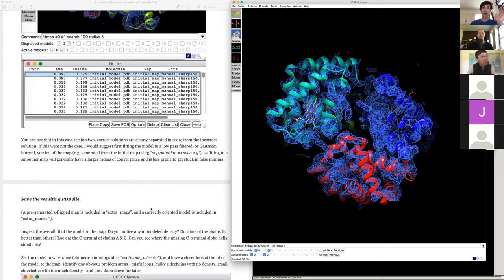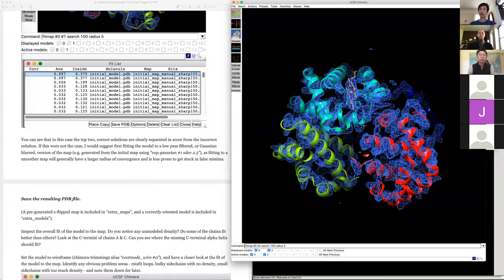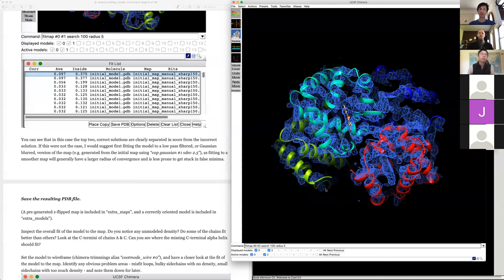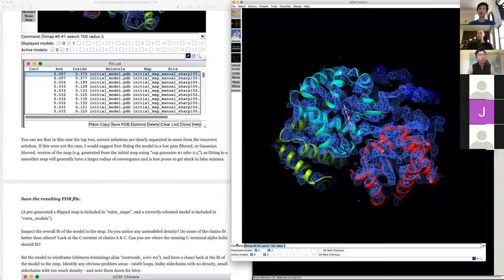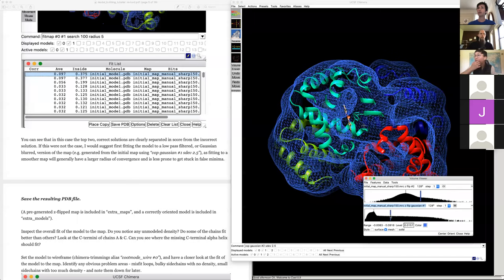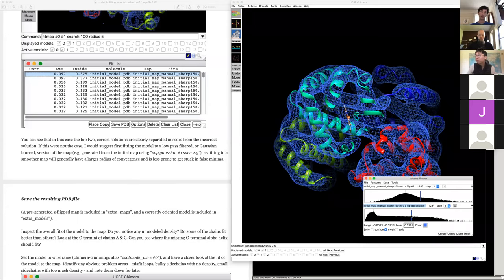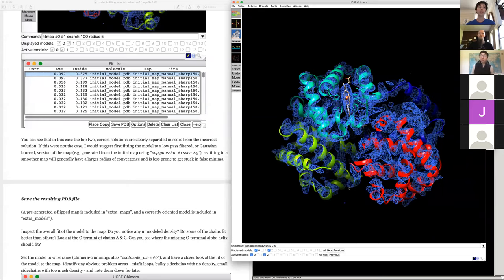If that doesn't work, I'd suggest blurring the map — you'll have a much larger radius of convergence with a low-pass filtered map. In Chimera you can do that via Tools > Volume Filter, or using a command like 'vop gaussian' with sdev 2.5. That gives a much blurrier map that's easier to fit things to. We don't need that right now, so I'll remove it.